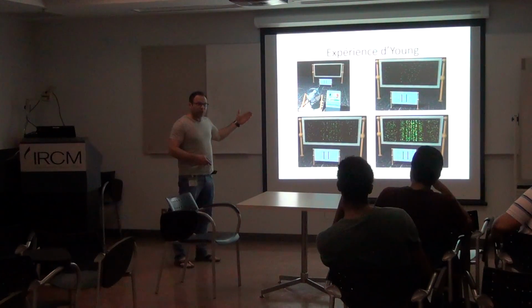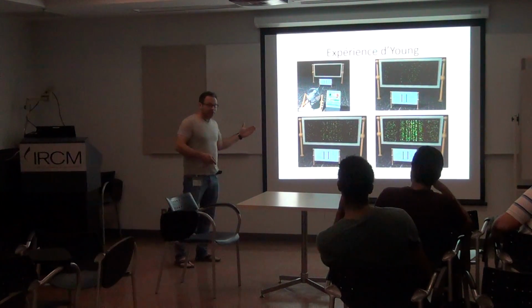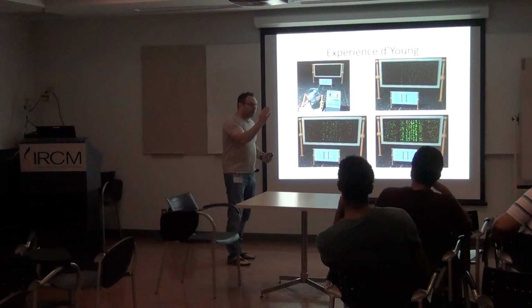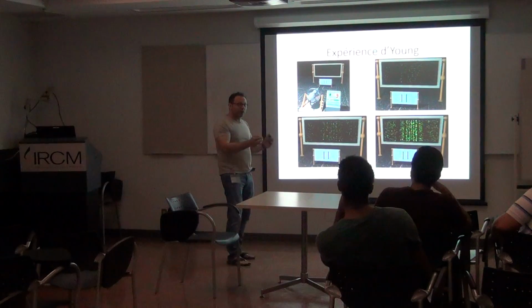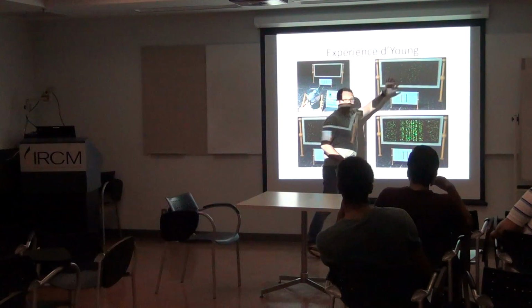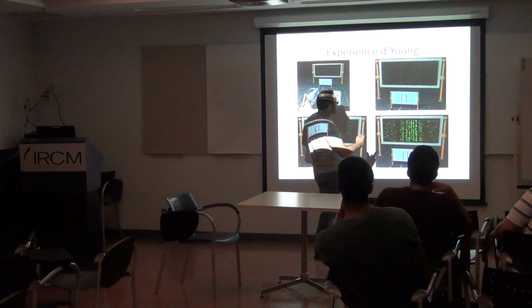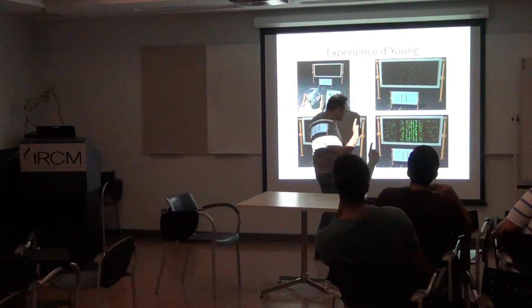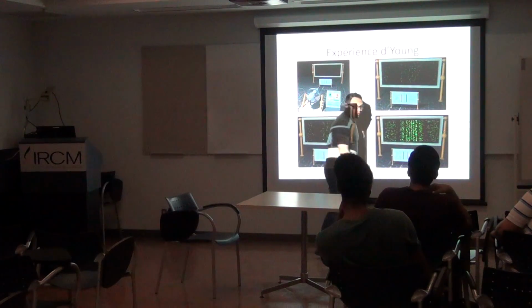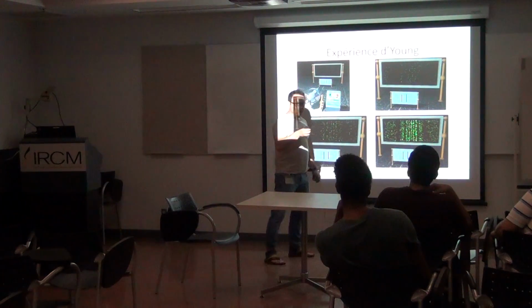That's basically what we do also when we do super resolution microscopy, because we are counting photons, so we can measure with more precision by having more data of a single fluorescent molecule, and this pattern will also grow like this. So the example would be: if I measure only one fluorescent molecule, instead of going into this slit, it's going to go into my objective.